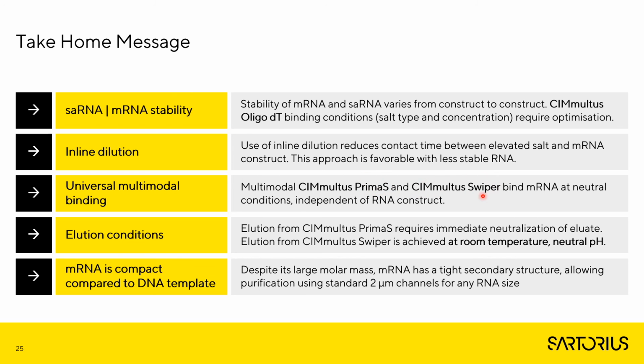The same with the Swiper molecule, the Swiper chromatographic column. And with these columns, we can also achieve elution of RNA at room temperature. In the case of Swiper, we do this in a neutral pH.